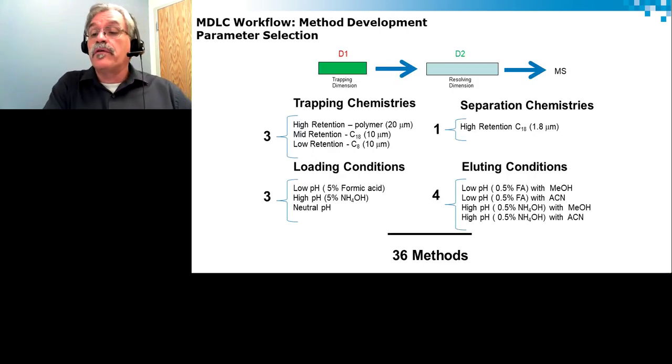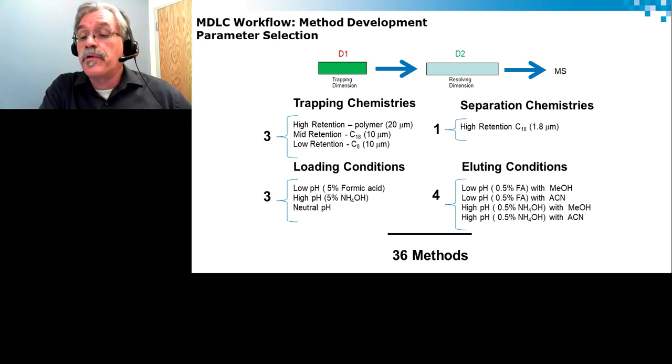These are the ones that I usually use for most of the applications that I work with. I start with what we call the 36 top methods, which I create into a grid called the 6x6 grid. This allows us to go through the process of looking at how to optimize methods.